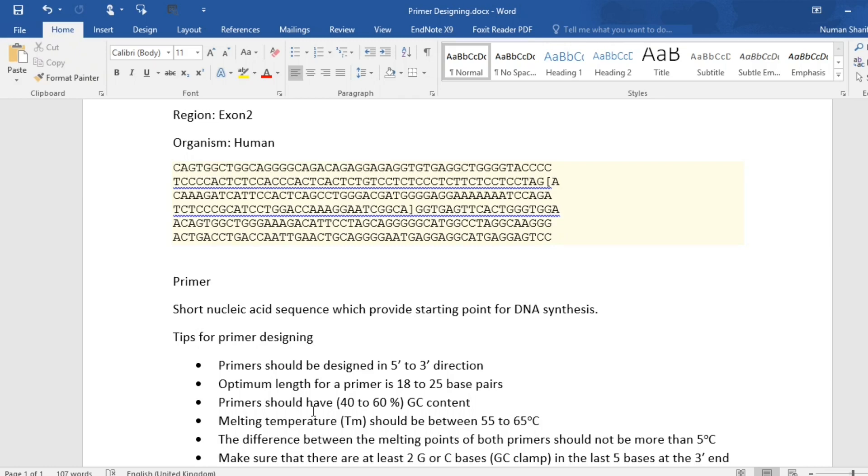The melting temperature for a primer should be between 55 to 65 degrees Celsius.